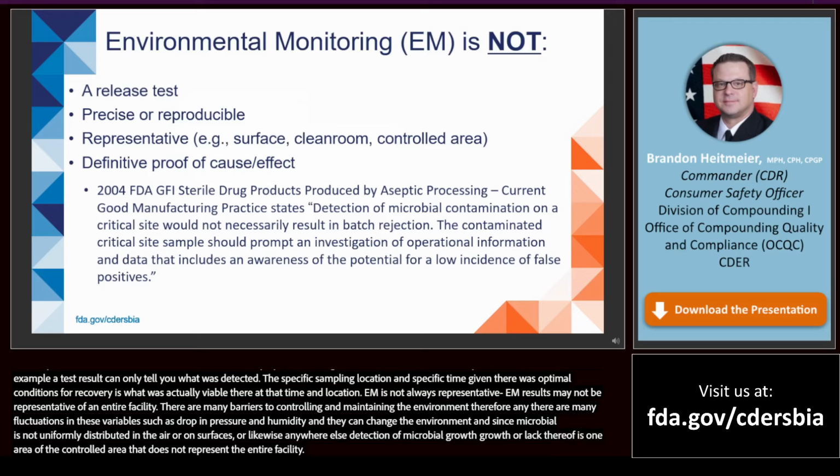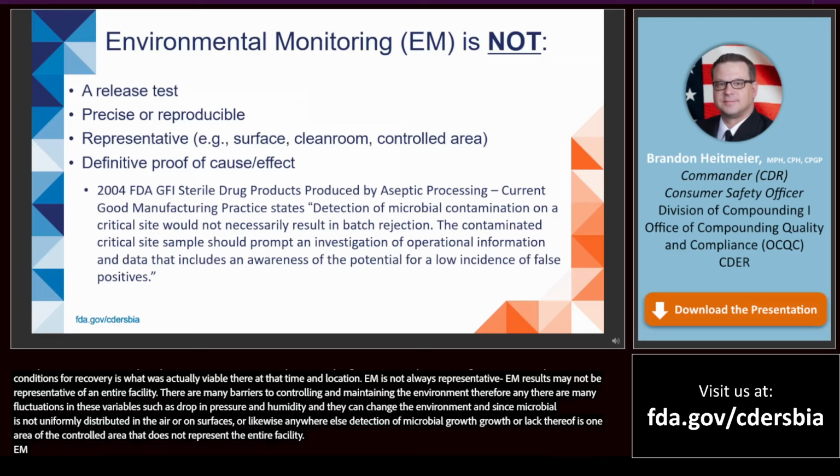EM is not a definitive proof of cause and effect. It can be difficult to prove cause and effect based solely on the results of environmental monitoring. In particular, low-level contamination can be particularly difficult to detect. It's literally finding a needle in a haystack, except this needle is microscopic, right?